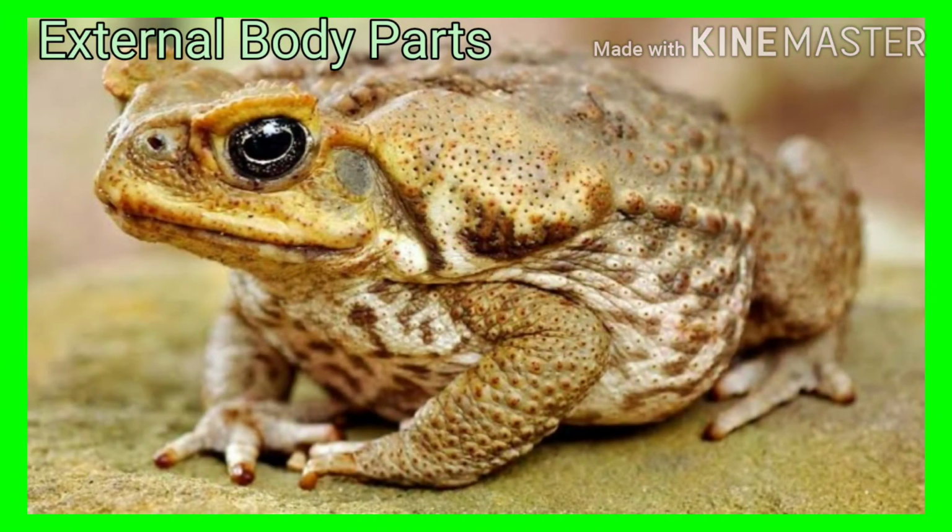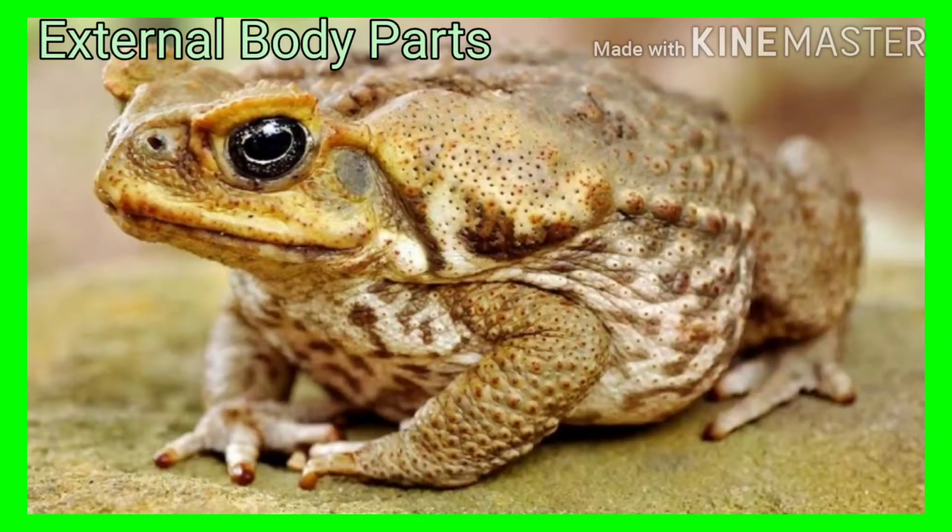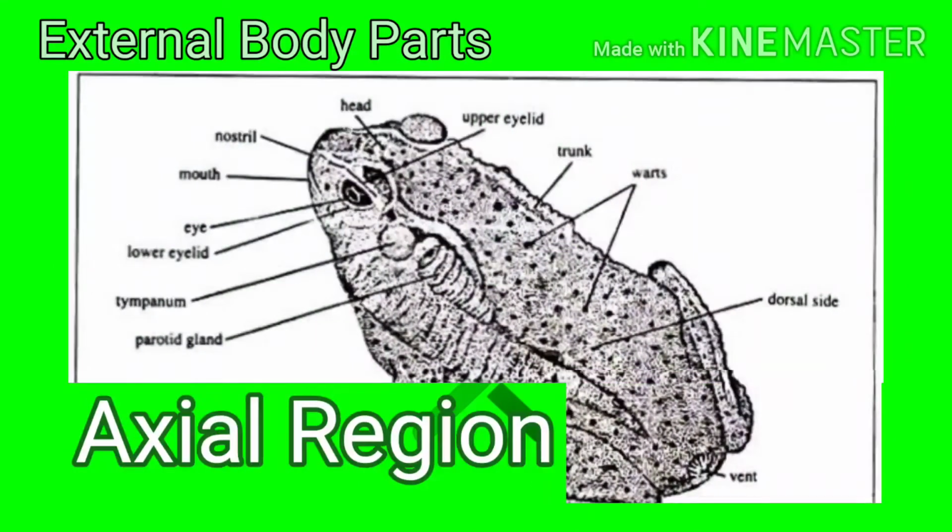Let's proceed to the external body parts of the toad. The toad's skin, which hangs loosely on the body, lacking loose connective tissues, must remain moist in order to serve as a respiratory organ. The body is divisible into two regions, the axial and the appendicular. The axial region is composed of the head and the trunk, with almost no neck at all.